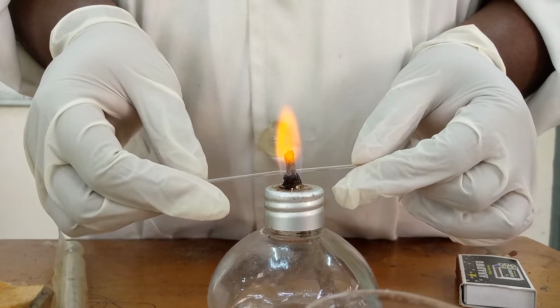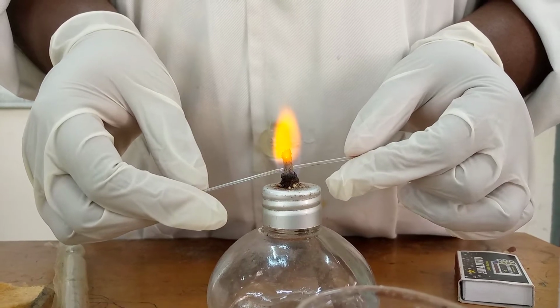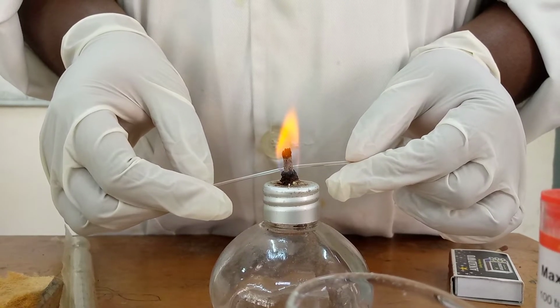So as it melts, it will close one end, or it will seal one end. So the tube is melting gradually. It's melting gradually.